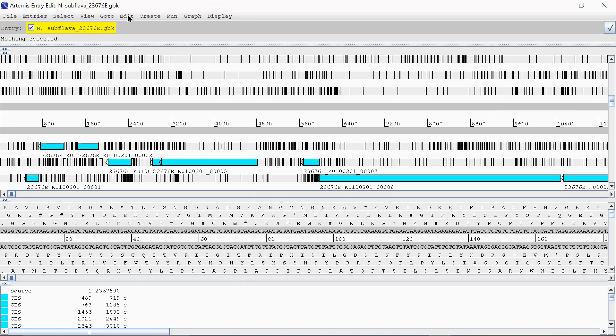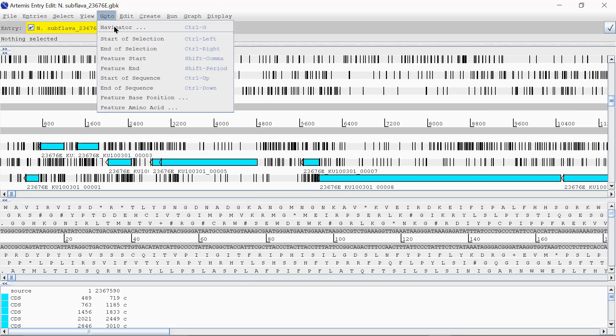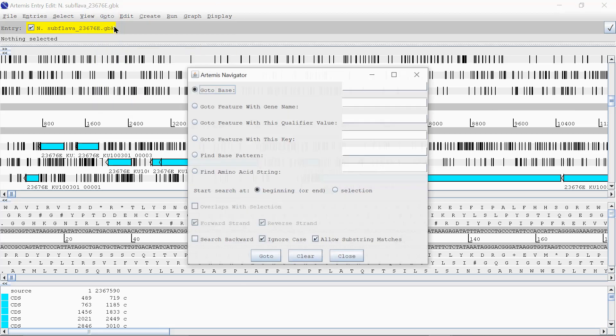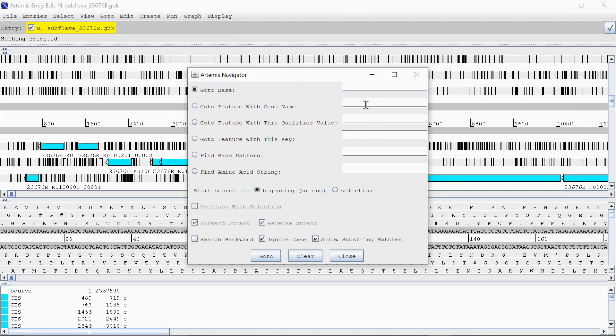If you know a gene name, and it's been annotated in your genome, you can actually find it. So if you go to this tab at the top, go to Navigator. I'm quite lucky, because I know roughly where it is. But, go to Feature With Gene Name.